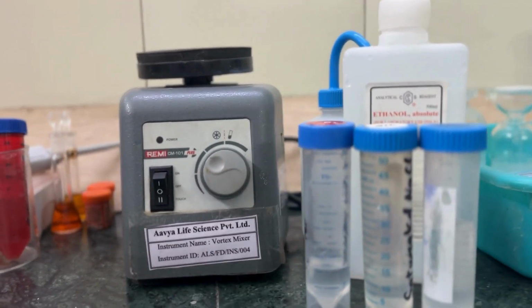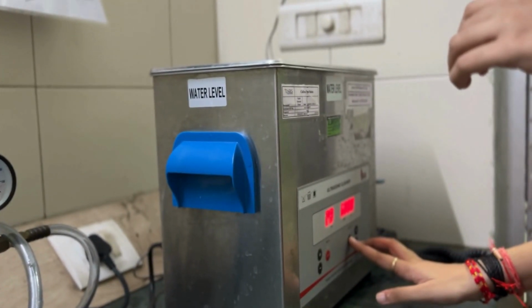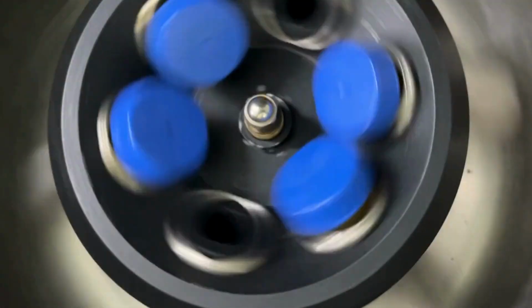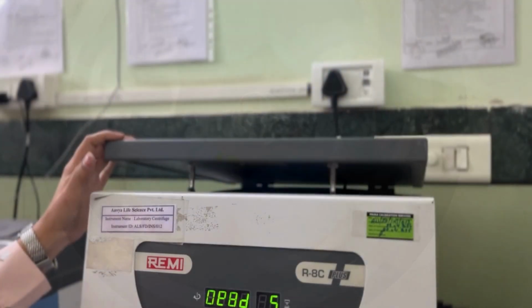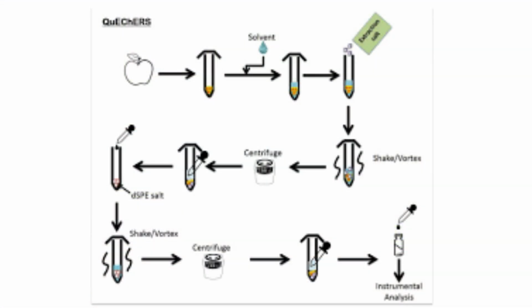For the sample to blend in with the diluent, it needs to be homogenized through vortex mixing, which uses centrifugal force as a principal mechanism, and then sonicated for about 20 minutes in an ultrasound sonicator. After that the solution makeup is done and is then added to the centrifuge at 5000 rpm for 5 minutes.